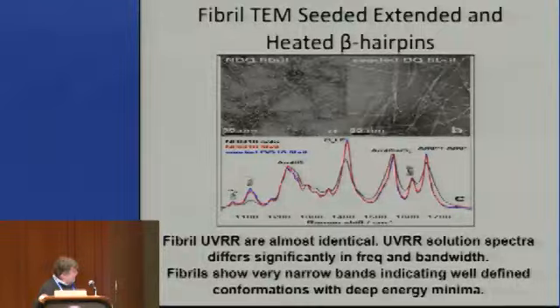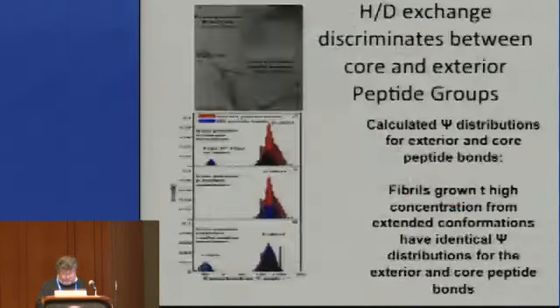You can compare the fibril Raman spectra to that of the solution, and you can easily see that the solution spectra are characteristically broader than the fibrils, but the two fibrils are almost identical, although the amide 3 points out that the spectra are a little different. We're in the midst of probing this. We have not figured all this out yet, but there are differences that we can interpret.